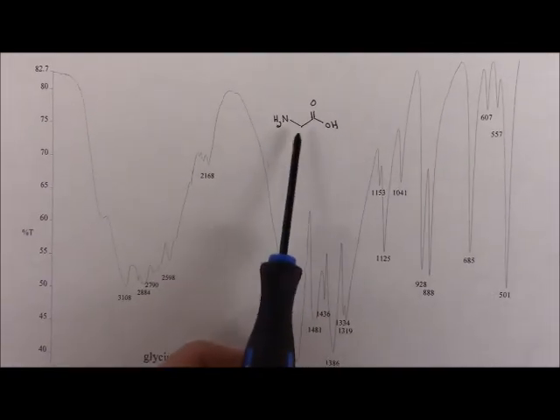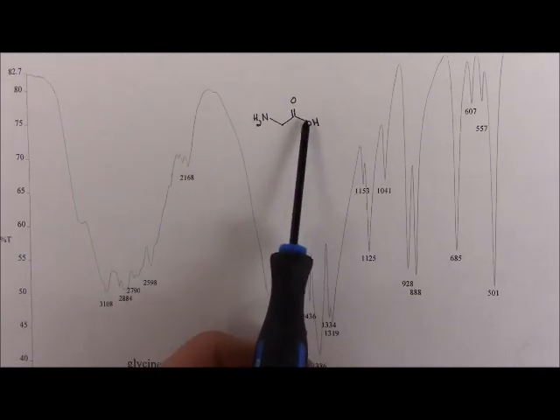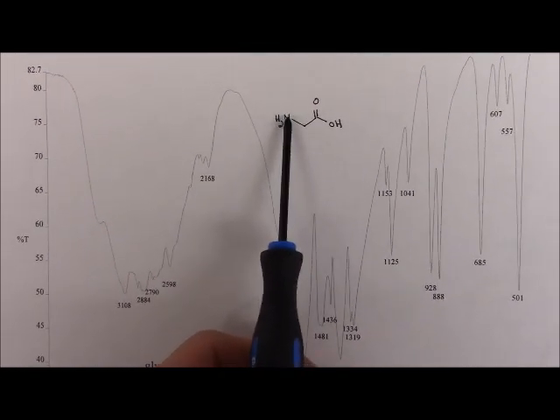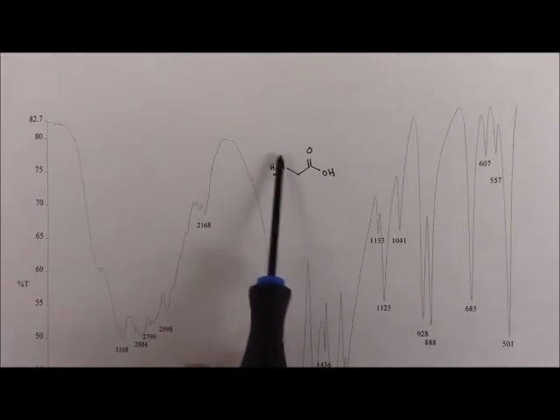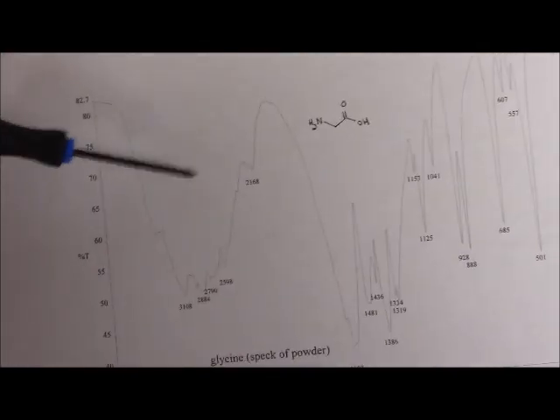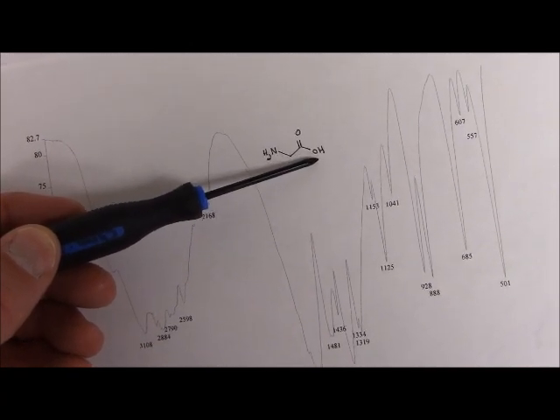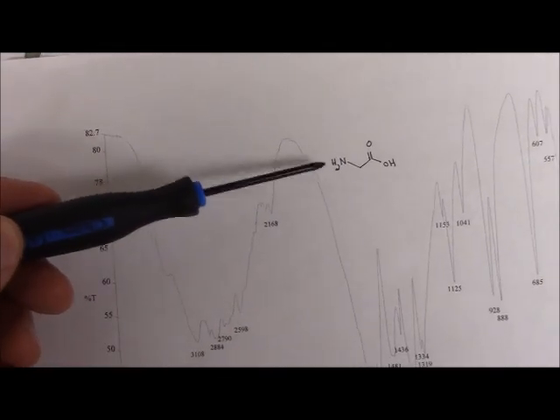So it's almost as if in the solid structure, some of it is protonated, but yet some of it might not be protonated. It's the carboxylate anion, and this gets a positive charge on it. So not only do you have normal NH2 stretches, but you could have NH3 positive charge types of stretches. So long story short, you get a real mess. So this whole region here, the best you could do is kind of circle it and say it's your OH carboxylic acid stretch. You could show this deprotonated, positive charge here, negative here, and say and/or the NH3 plus stretches.